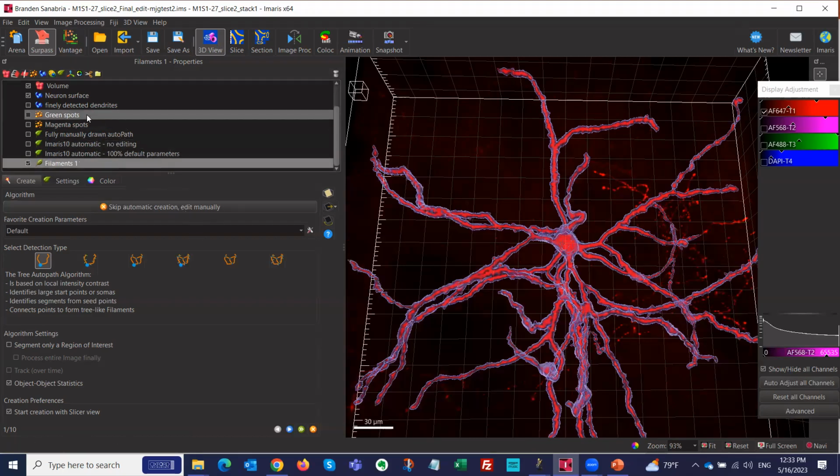The other difference is that vasculature was always kind of neglected. There was more focus on neurons and the tree-like structures. Now everything is together in one thing. So the autopath and the threshold are all taking the same amount of care now. So everything is integrated, so to say, okay?